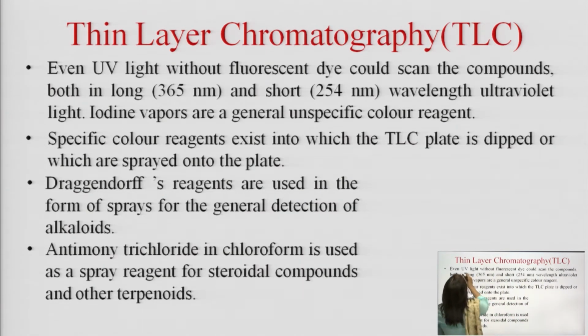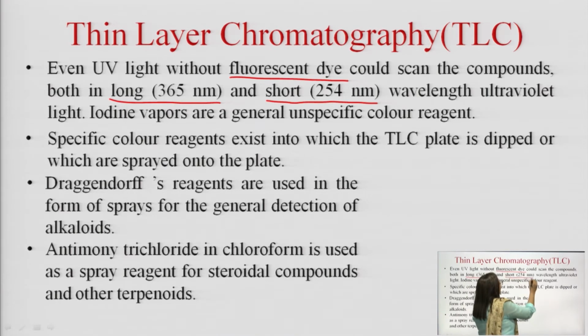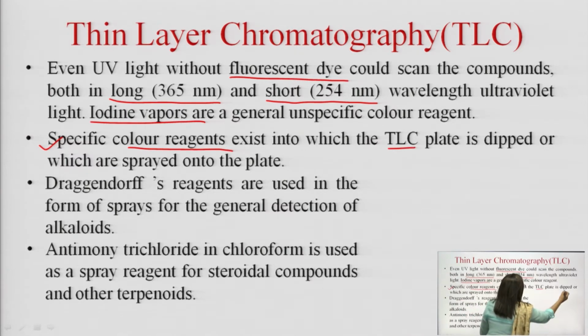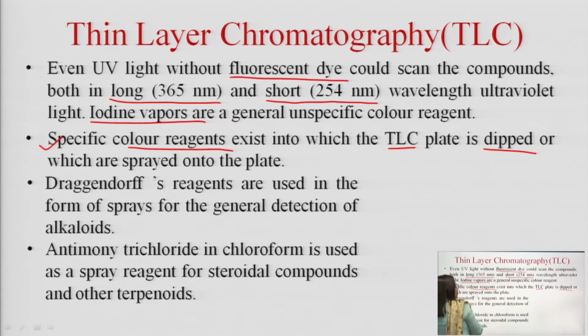Okay. So, UV light without fluorescent dyes could also be utilized to scan the compounds, both in long, that is 365 nm, or short, that is 254 nm wavelength. Another very generalized and unspecific reagent that is utilized is iodine vapor for the determination of the solutes or the separation. Okay, specific color reagents can also be utilized in TLC by either dipping the plate into the reagent system or spraying onto the plates.